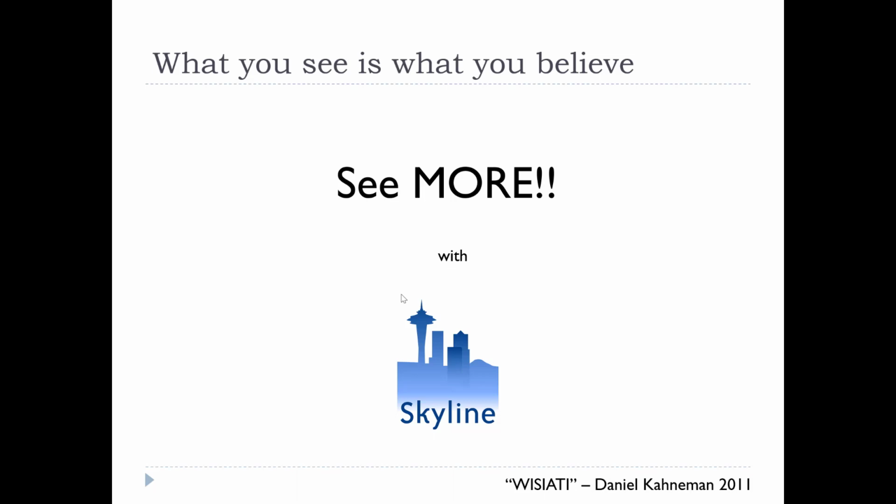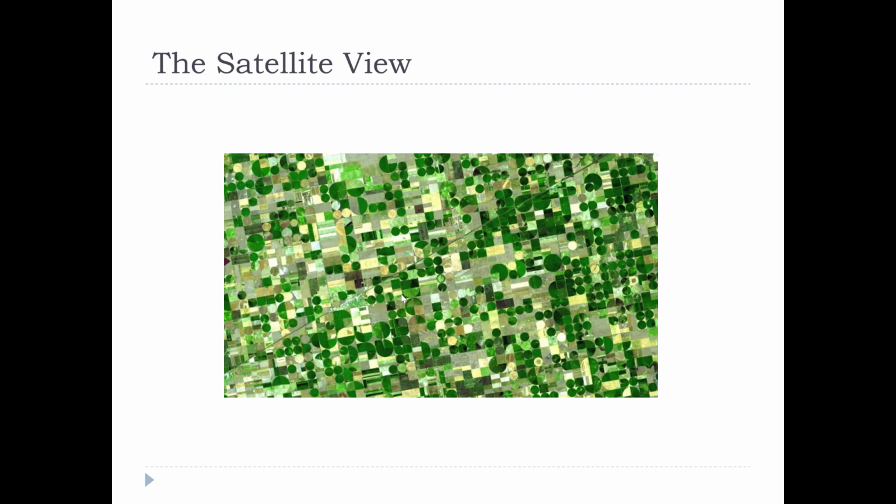And so you will come up with an explanation of the information you see, and it might be wrong if you're not seeing it. So I changed that to: what you see is what you believe. If you see a limited set of information, then you will have an answer that is limited in some way, and if you're not seeing the whole story, you might be wrong.